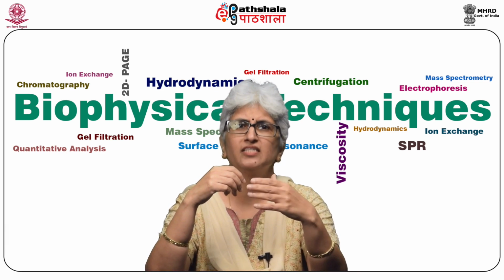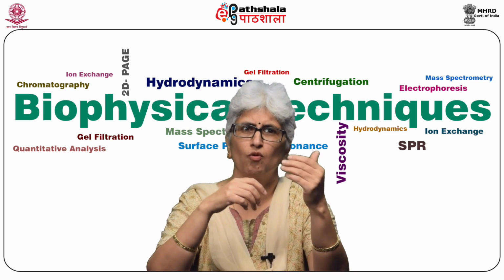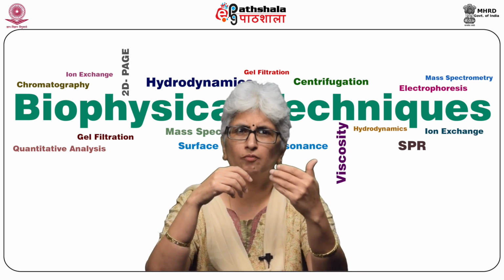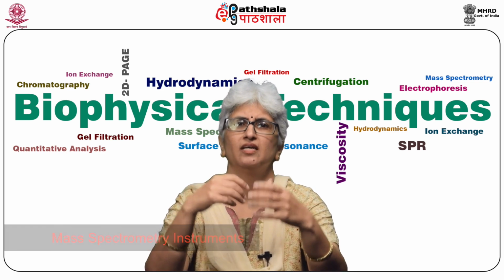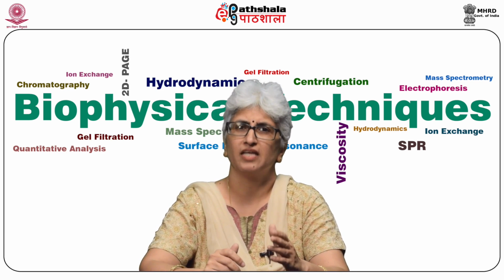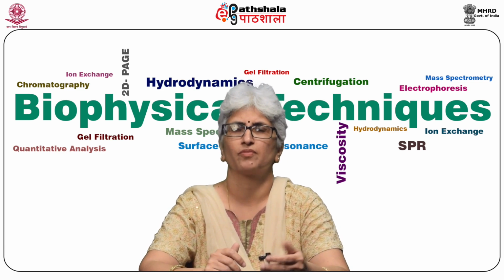This field is still developing and is nowadays widely applied to explore areas such as post-translational modification and protein-protein interaction. In recent decades, the development of mass spectrometry instruments and their coupling with reverse phase affinity chromatography has helped enormously in disease biomarker discovery.